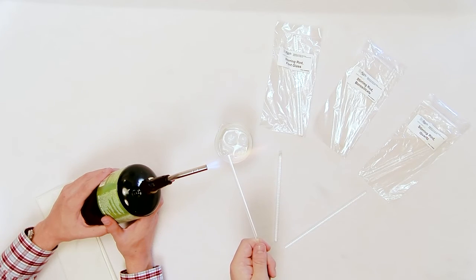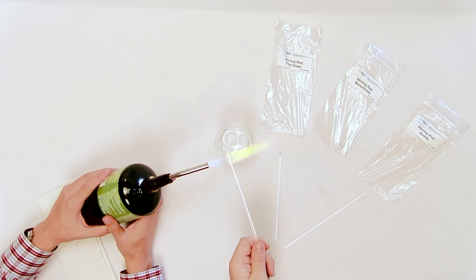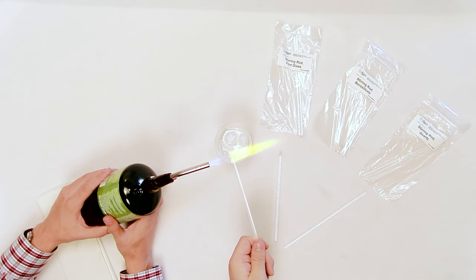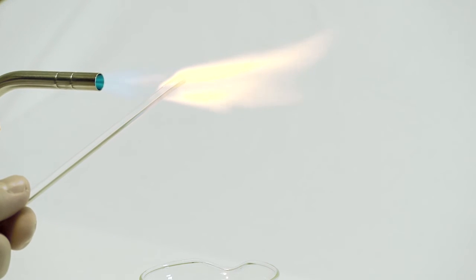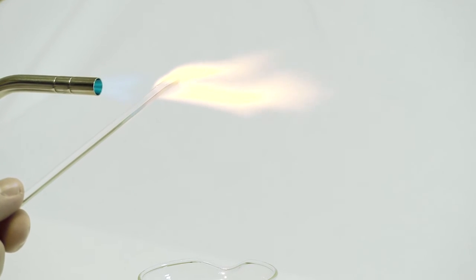Heat one end of the borosilicate glass rod in the flame, keeping about 1 inch of the rod consistently in the flame. Sagging or slumping should be harder to achieve, but the end should fire polish, become smooth or polished.